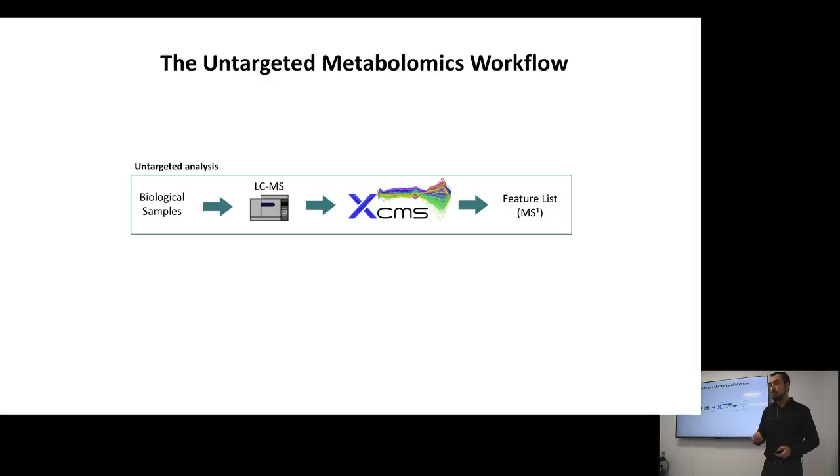Now, it's important that before we do any identification of our peaks, we annotate that data. And it's important for two reasons. The first one is that we need to know what feature is what. We need to know that this feature is a protonated species, that feature is an adduct, is an insource fragment. And second, we want to have a putative identification of the identity of that feature, so we can enable a systems biology analysis, an analysis at the systems level, of our samples, of our biological question.